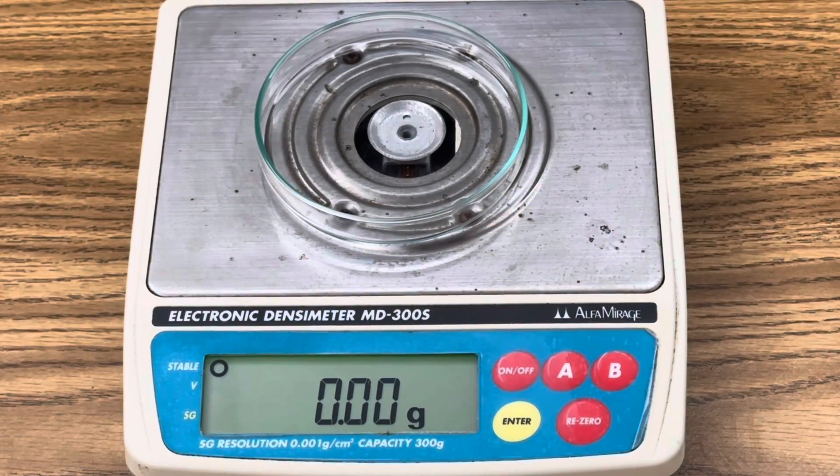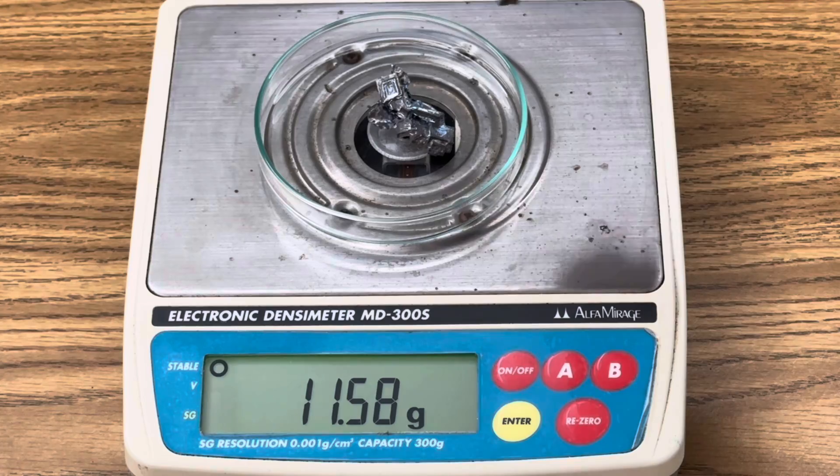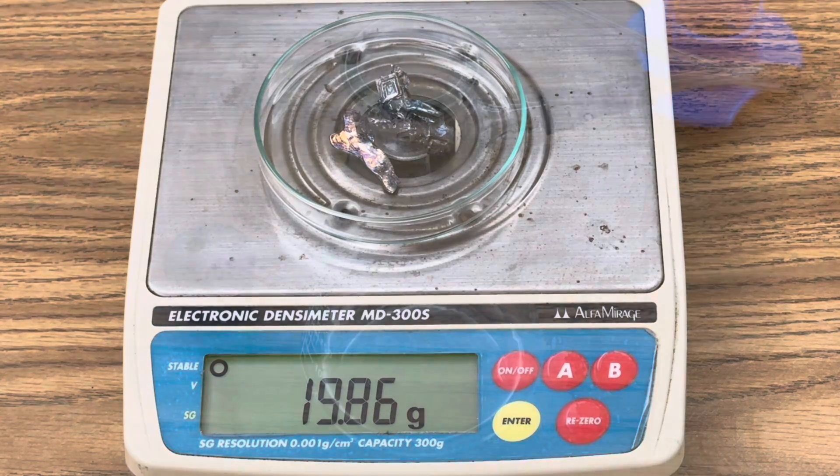The first thing I want to do is measure out about 20 grams of bismuth — that's pretty close, 19.86. Bismuth will dissolve in nitric acid at about a one to three ratio, so I'm going to need about 60 mils of nitric acid to dissolve 20 grams of bismuth.